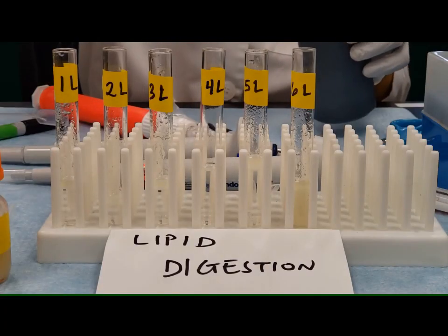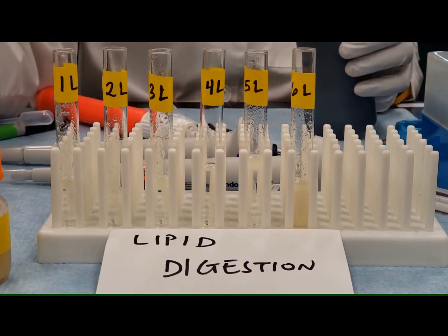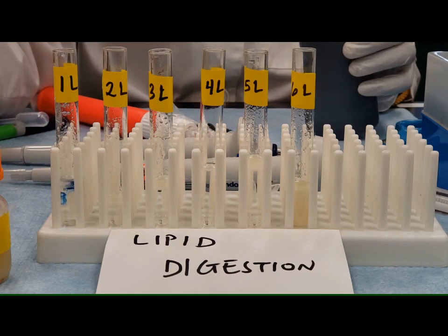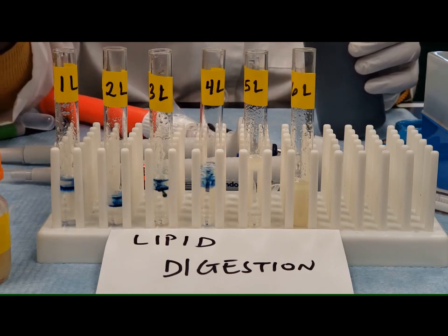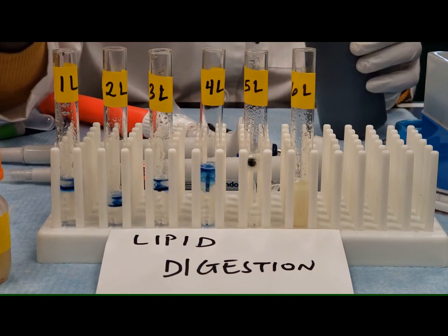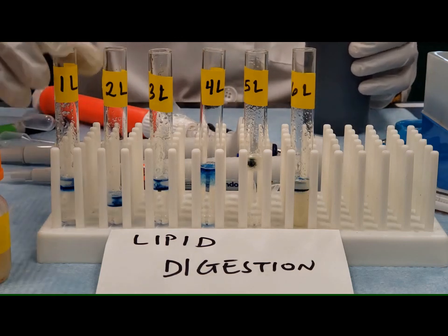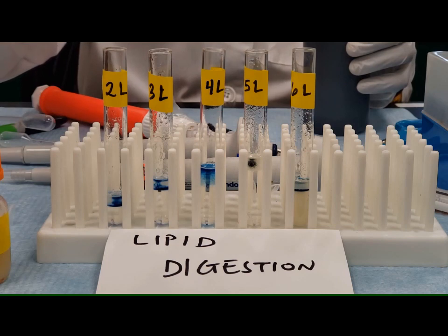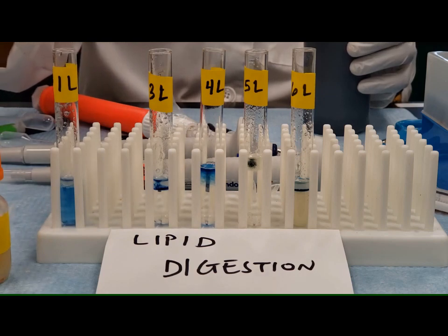So what I'm trying to show you now is how bromothymol is used as a pH standard indicator for the lipid digestion test. So you see where you had 2 drops of bromothymol to each of your test tubes, it turns blue in color, and that color is supposed to be close to the bromothymol standard at a pH of 7.2. So what you do is, after you vortex it, make sure that the color is close to what you have for 7.2, so you have to compare with the standard.